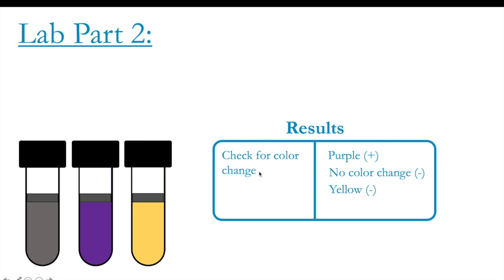And this right here is the results table. So once again, you'll check for color. Purple is positive. No color change is negative. Yellow is also negative, but with the addition of fermentation.